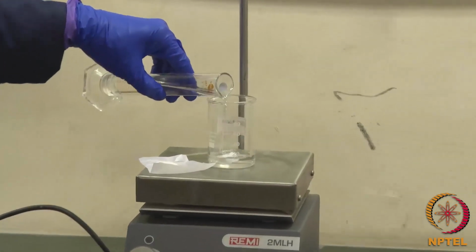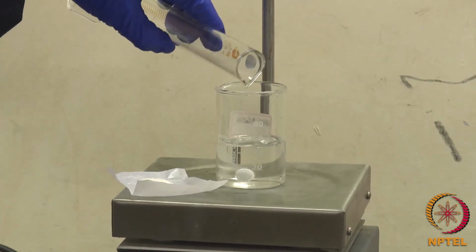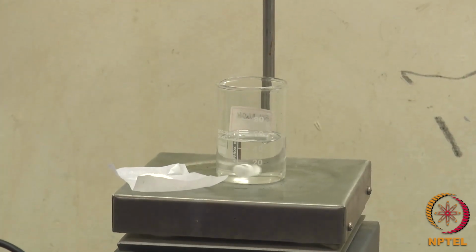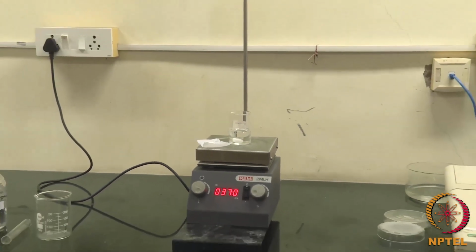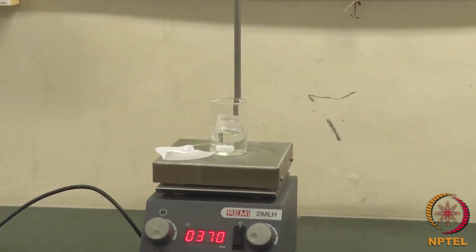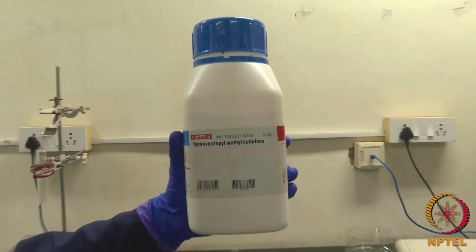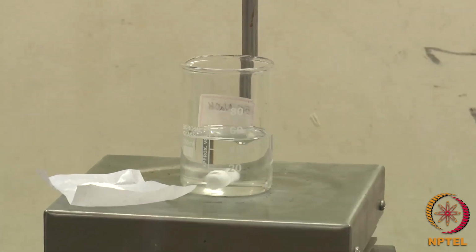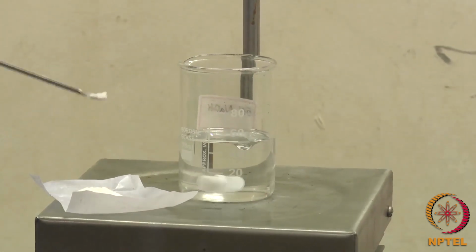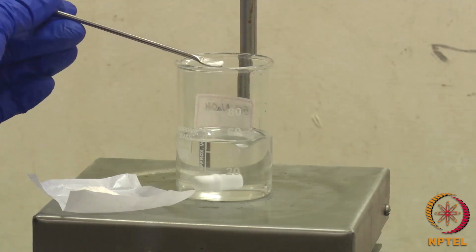50 milliliters of dichloromethane was taken in a beaker. Weigh 750 milligrams of HPMC and add slowly to the DCM with vigorous stirring.